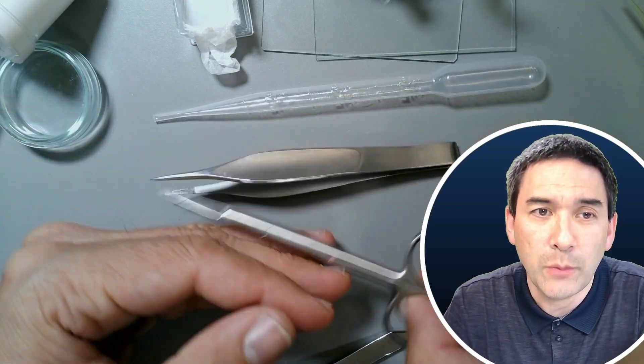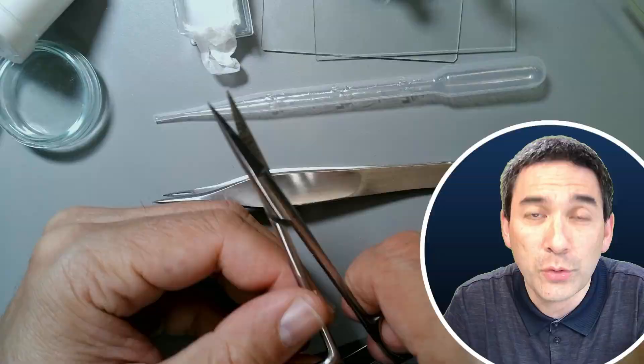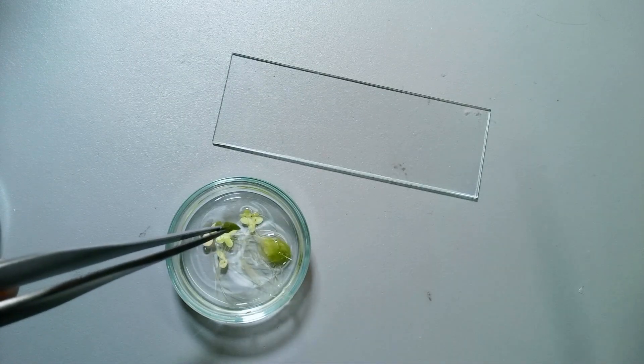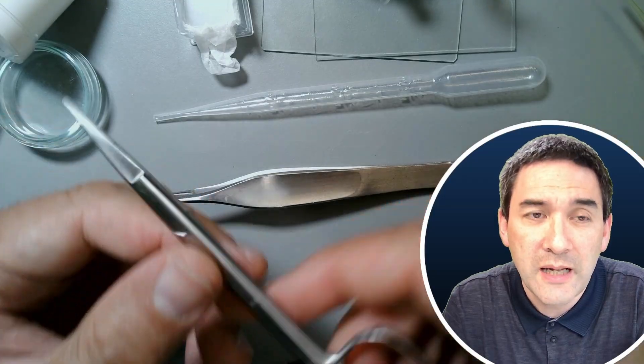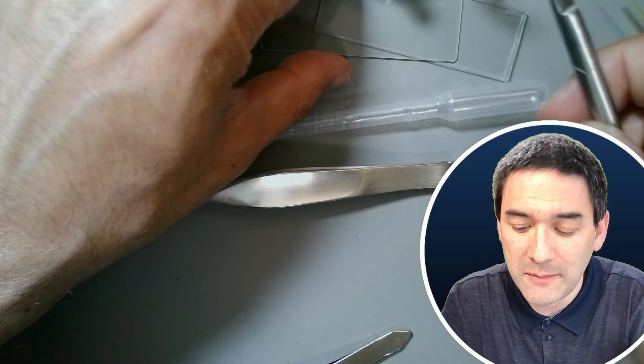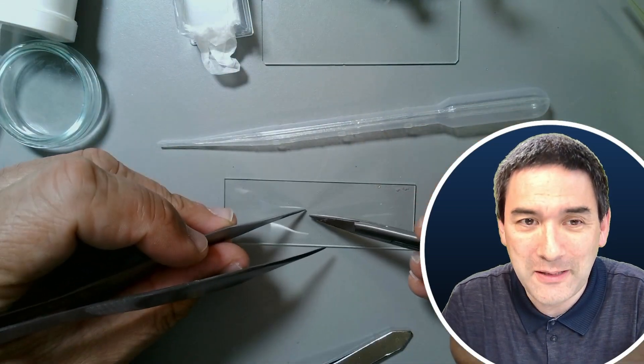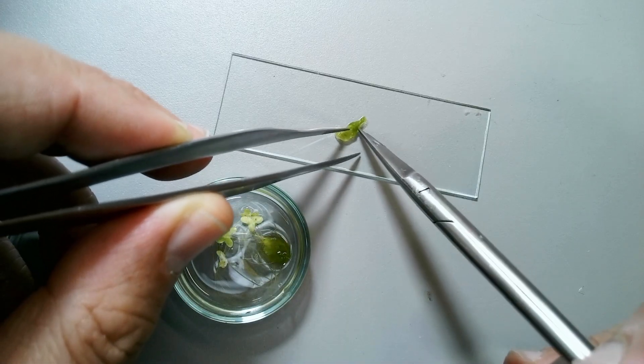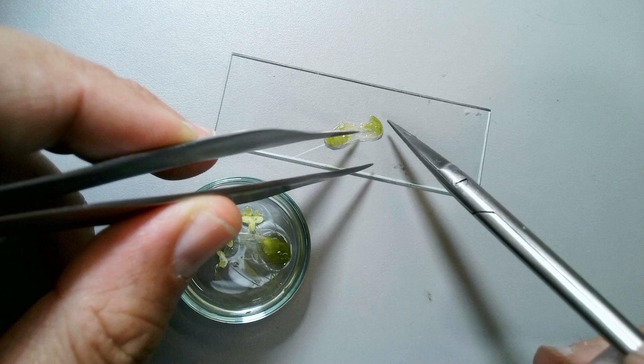Last but not least, I recommend scissors. Specifically, the small pointed scissors here are quite useful. If you want to observe algae in water, you can cut the algal filaments and small plants using this pointed scissor. It's also useful because sometimes I actually use this scissor to manipulate and push the specimens around and pick apart some specimens. Those tools sometimes have multiple uses as well.